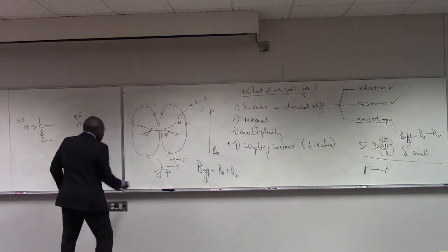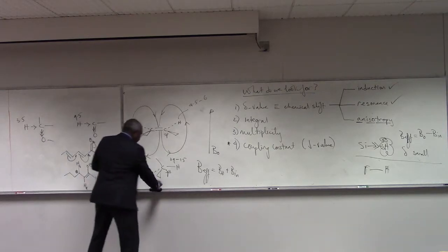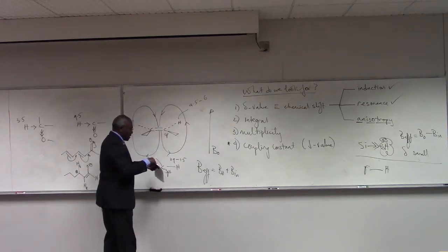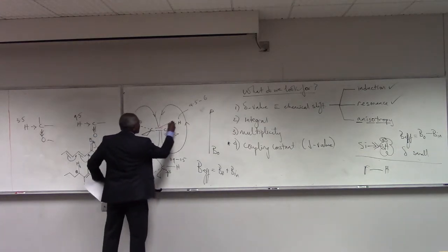So what many people do is they divide the molecule into what are called cones. And I'll draw a cone in red, and the cone looks like this.